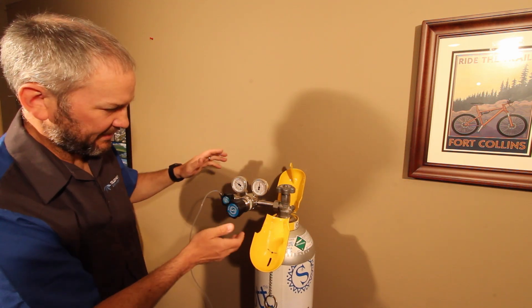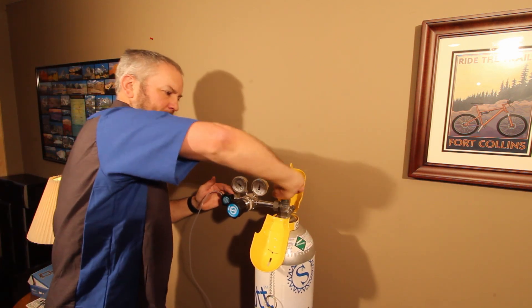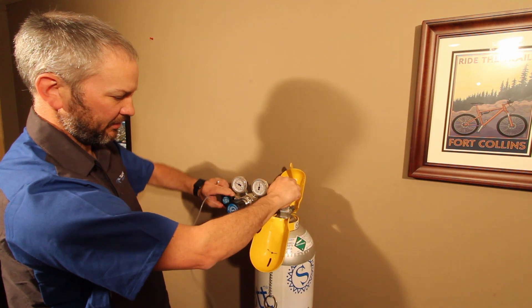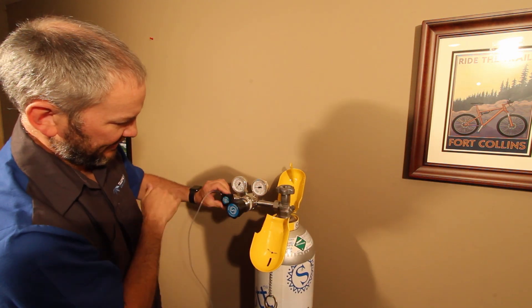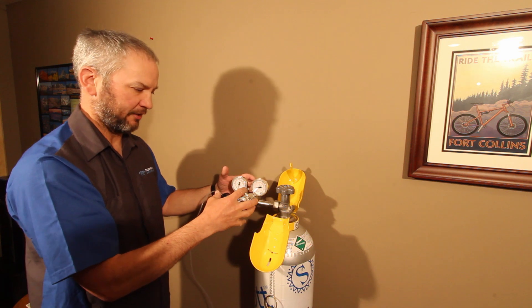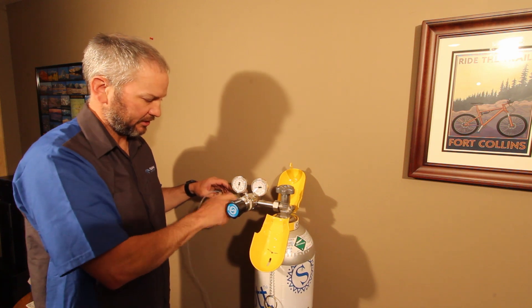I've got 30 PSI dialed in and about 1650 on the cylinder. I'm going to close this off. Now my cylinder is closed and my output is closed. I'm going to open the output all the way and bring both gauges down to vacuum. What we're doing is trying to get all the captured air that was in this regulator out, so the only thing we're going to have in here is our application gas. Now we're going to close this again.